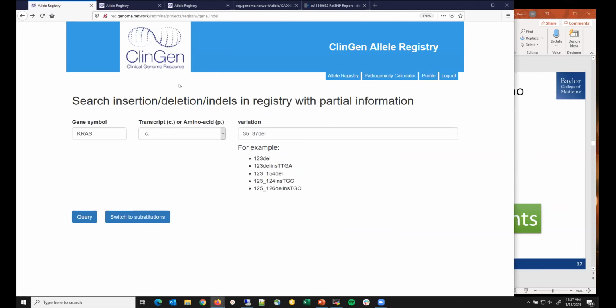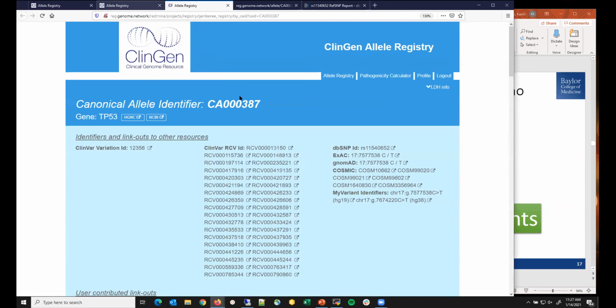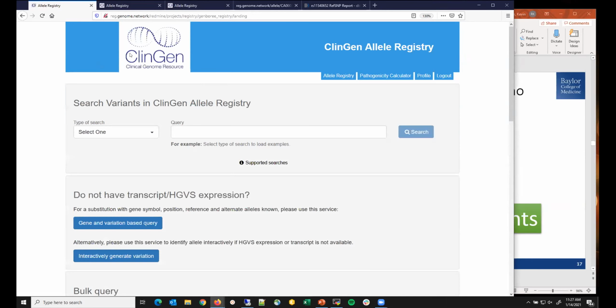So if we start at the beginning, I'm going to use that example that I copied from that class that I just registered, and expect to see this long number. You can see that these numbers represent pretty much close to the number of canonical alleles that we actually have. So this looks like 1.139 billion, which is pretty close to the real number, because everything essentially goes sequentially.